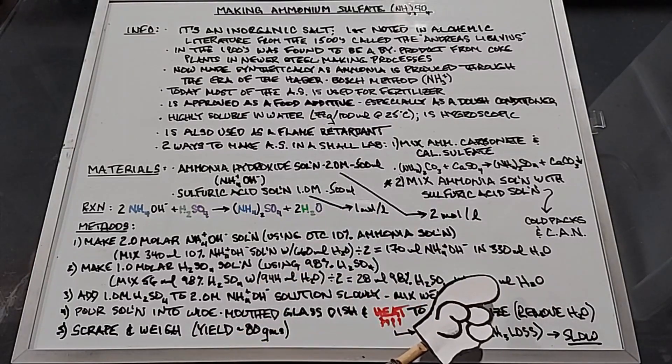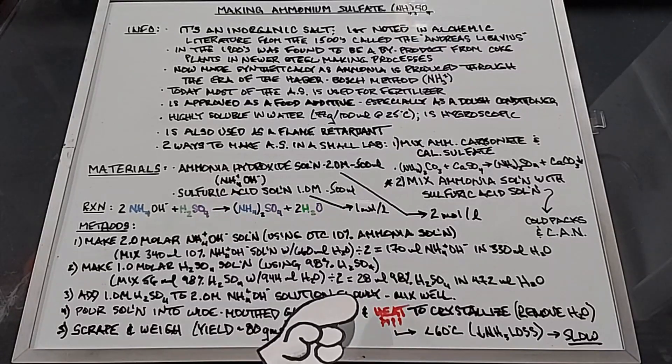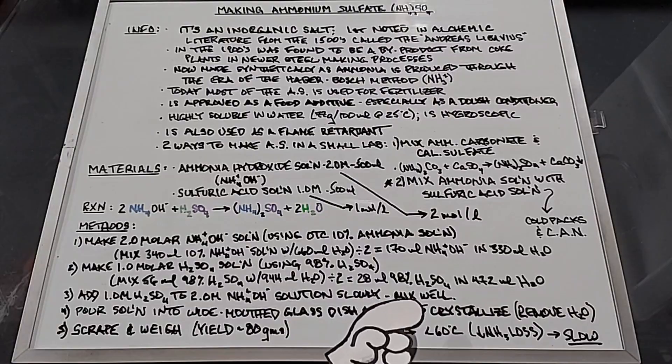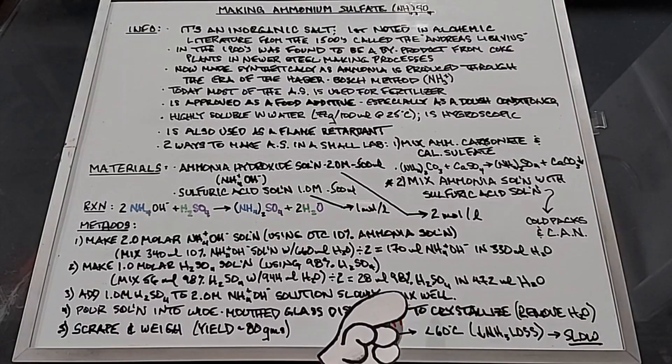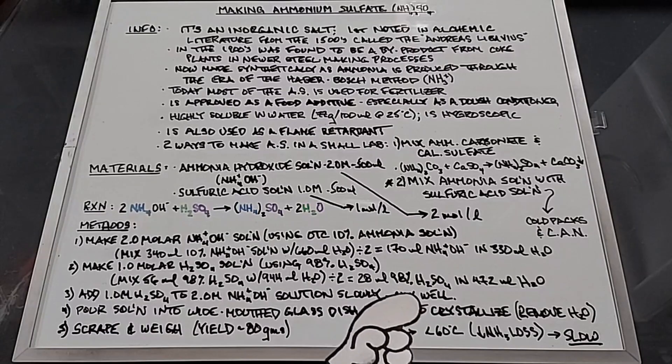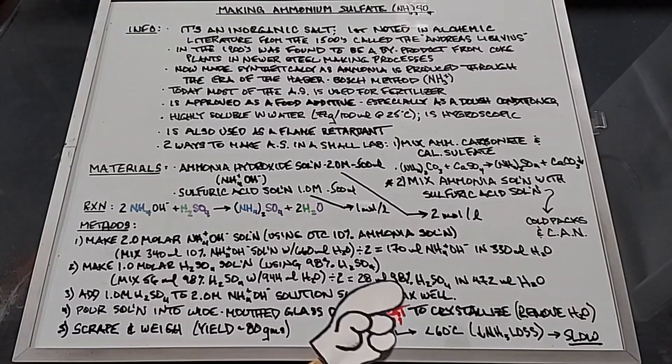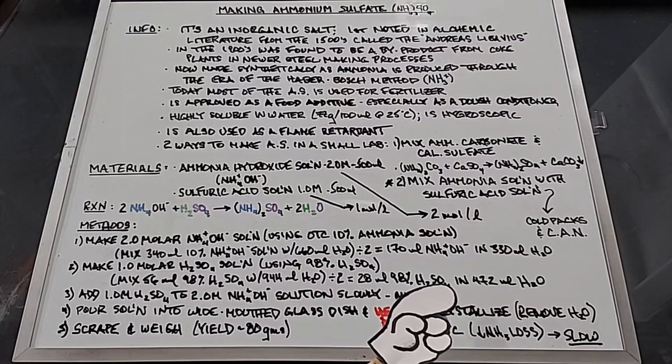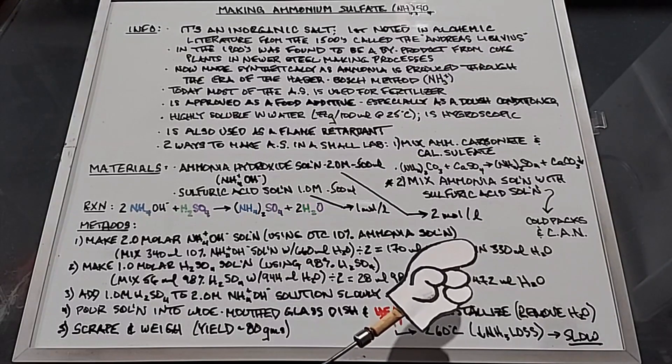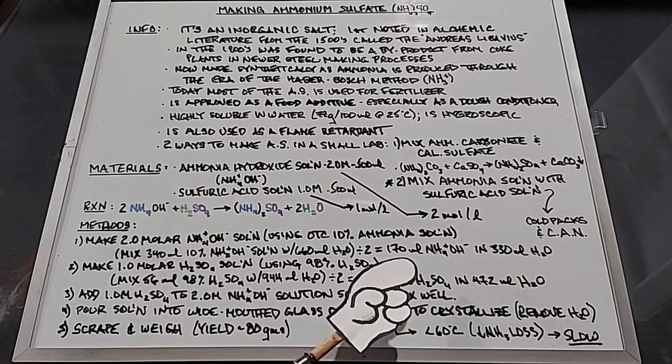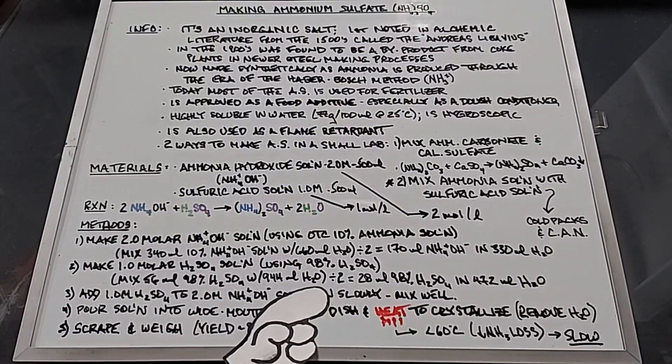Next we're going to add the one molar sulfuric acid solution we just made to the two molar ammonia hydroxide solution very slowly. This is exothermic. Once they're mixed we want to continue to mix them really well. One of the ways that you'll know you've mixed the solutions well is that when you are done mixing, the ammonia odor will disappear. The other thing that's important is you watch the pH. You want the pH slightly acidic, around 5, 5.5, even 6 somewhere in that range.